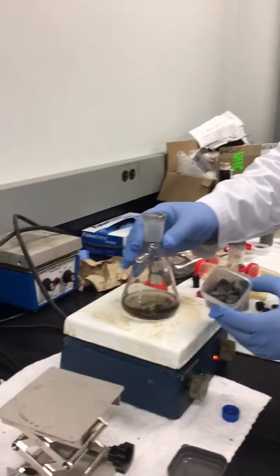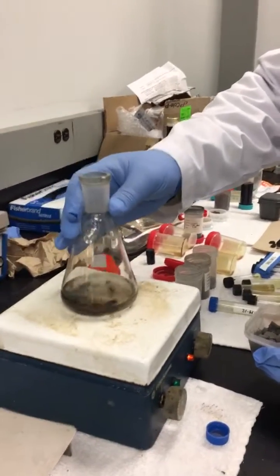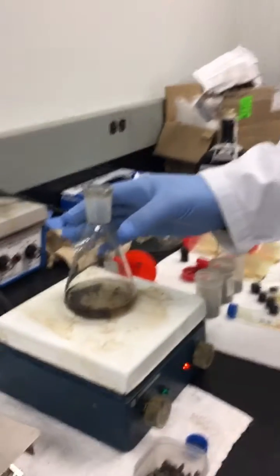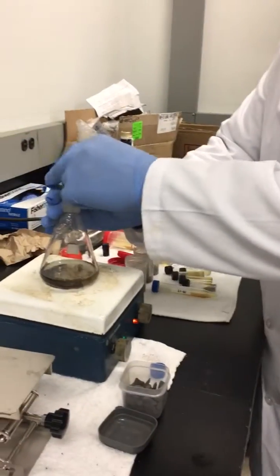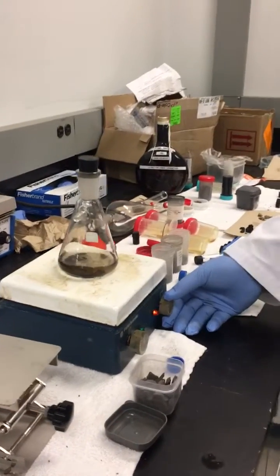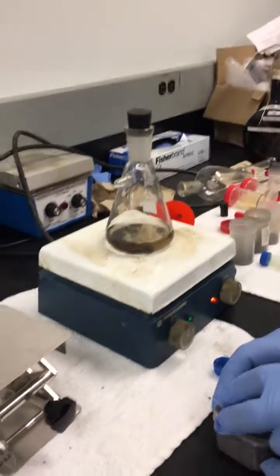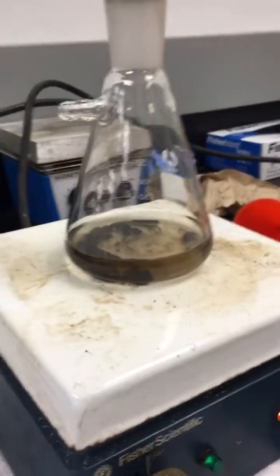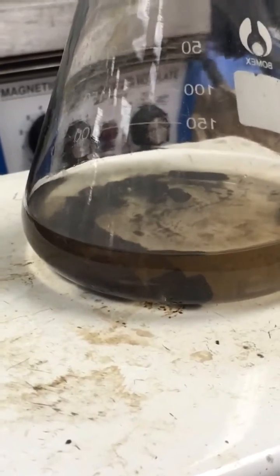With the original feedstock and liquid catalyst, you can already see discoloration of the catalyst. As the temperature rises, it will start to off-gas. You can see within less than 30 seconds we're starting to release the tight gas from the solid rock.